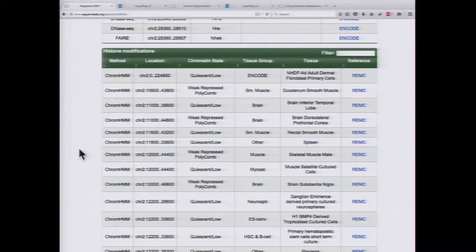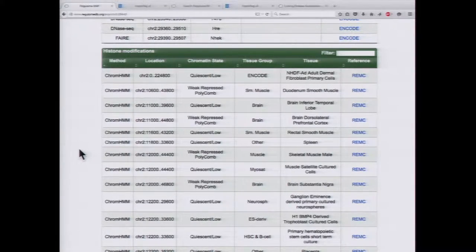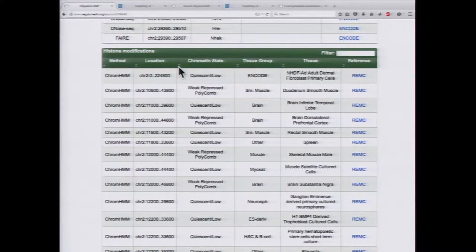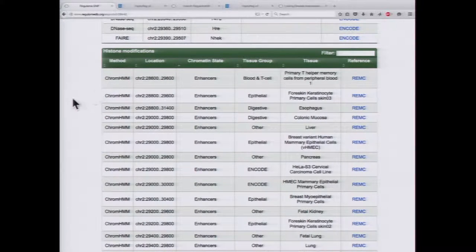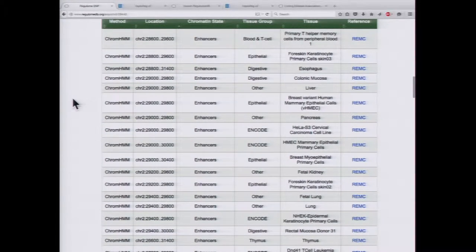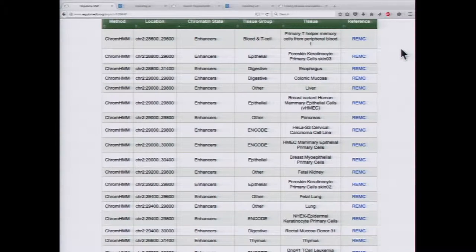On the bottom, we have data from histone modifications — annotations from ChromHMM, which you'll learn about tomorrow. ChromHMM annotates the genome based on different patterns of histone modifications into regions such as promoters, enhancers, and repressed regions. You can actually sort these annotations, and you can see this region is predicted to be an enhancer in many cell and tissue types. This is all from Roadmap data.